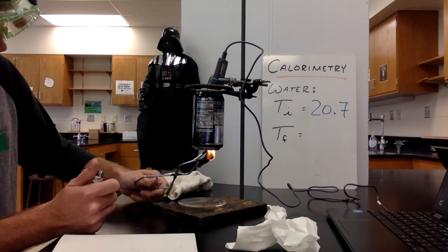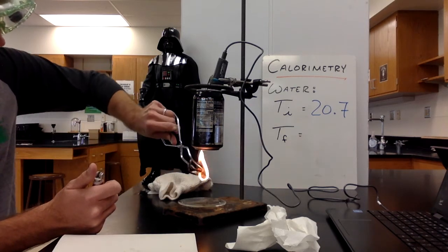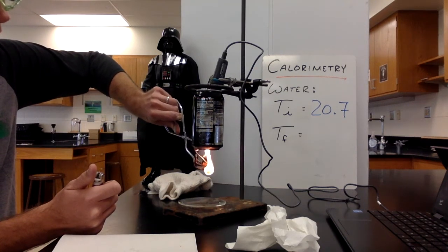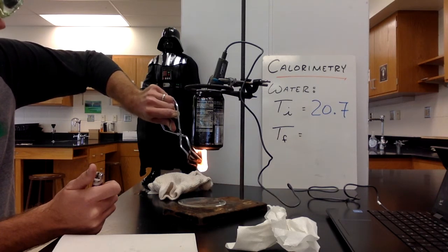Monitoring the temperature difference as we go through here. I'm getting a little spot of non-burnt. Trying to get that thing as cooked as possible.